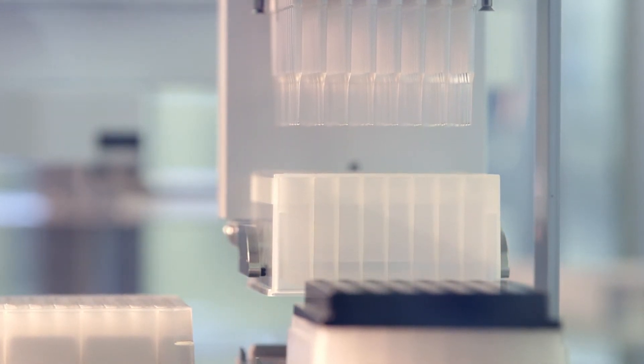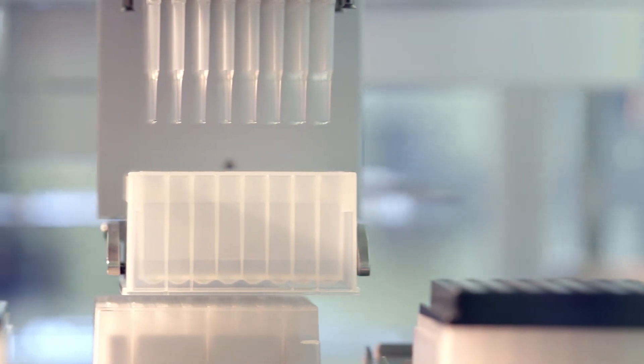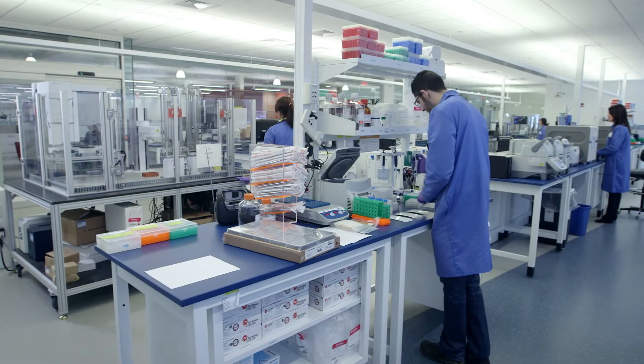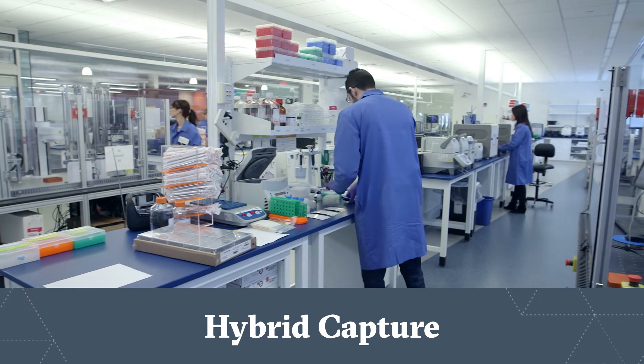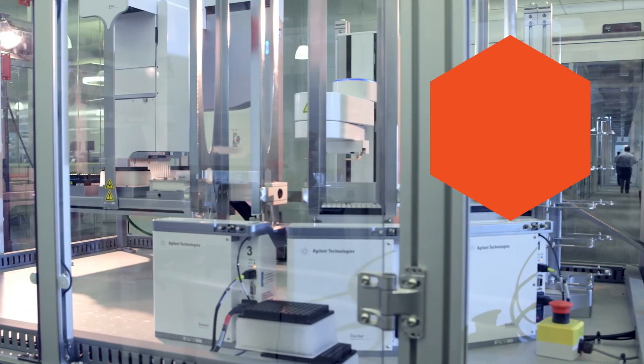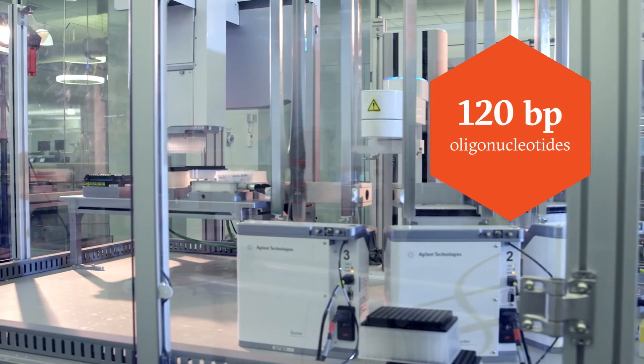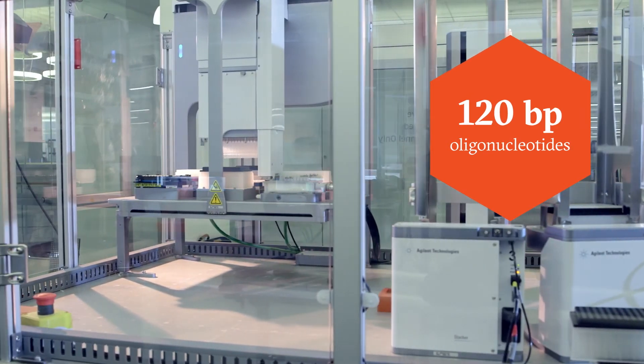Indexed sequencing libraries are then PCR amplified. The next step in the process is hybridization capture, where the cancer related genes in a patient sample are identified and separated from the rest of the molecules using DNA bait sets.